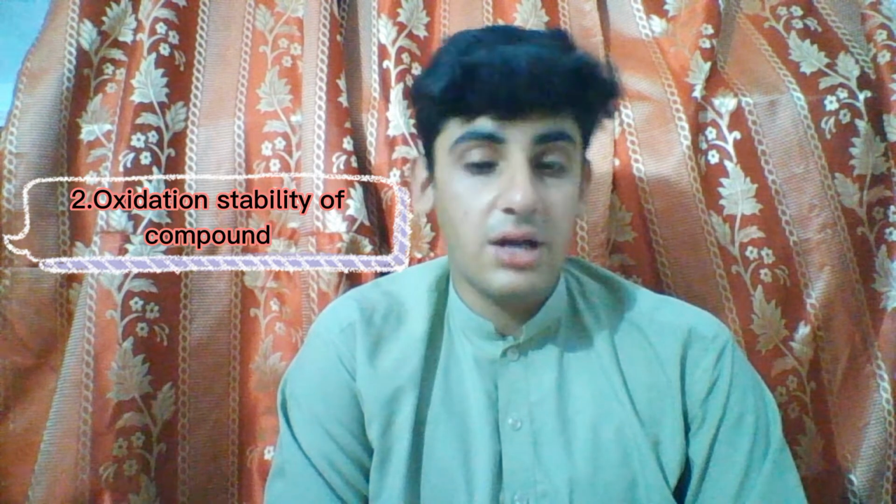as its stability on the application of heat, or its capacity to stay neutral on applying heat. So thermogravimetry tells us about the thermal stability of compounds. It also tells us about the oxidation stability of compounds, or oxidative stability of compounds. In thermogravimetry, sometimes we apply an oxidative environment to some compounds, so we basically check the oxidative stability of compounds in it. It also tells us about the decomposition kinetics of compounds, how fast a substance decomposes on heat.